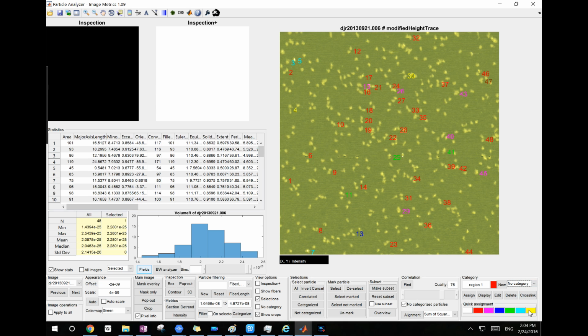If you place the mouse on top of a category, you see a tooltip that says what kind of category it is. This is round, this is tail, this is triple. Apparently the orthogonal category is not shown because there's not enough space. But you can still assign the orthogonal category if you select its color and click display and assign all the other things.